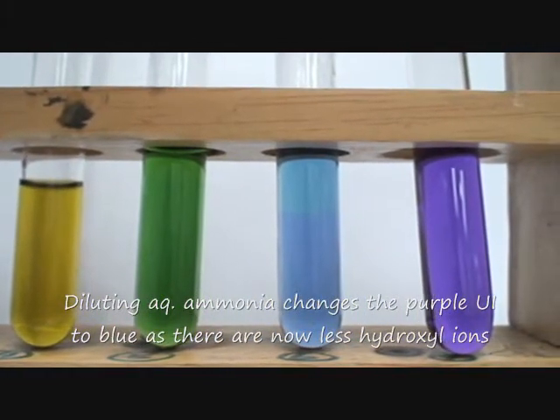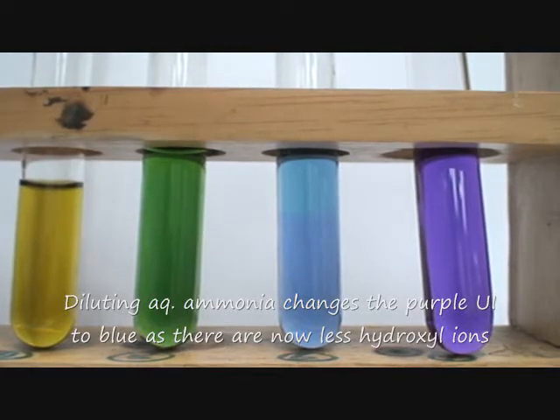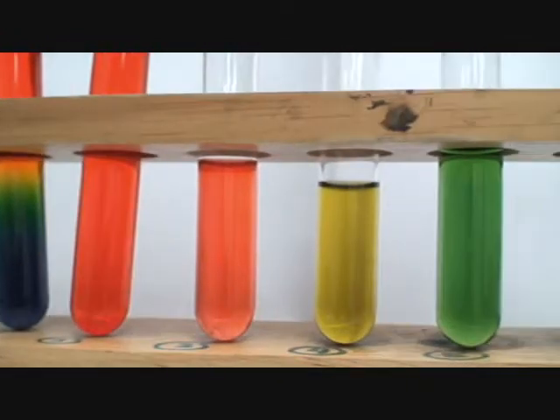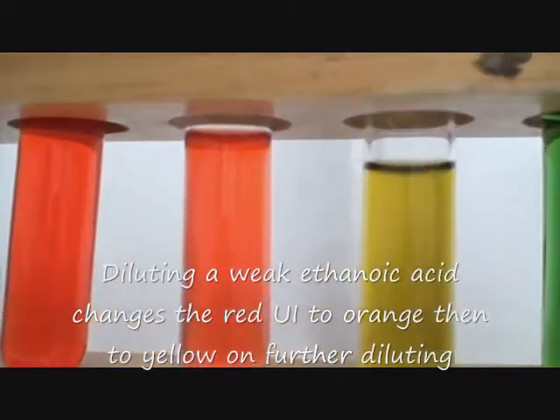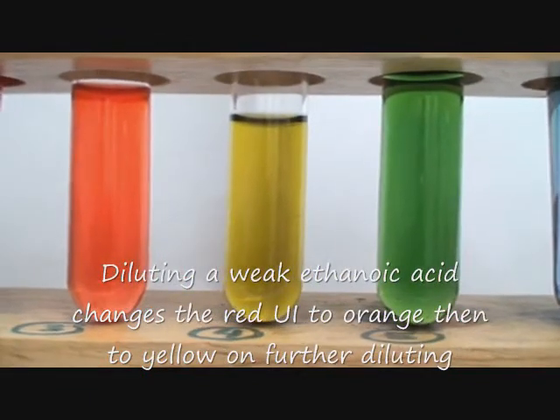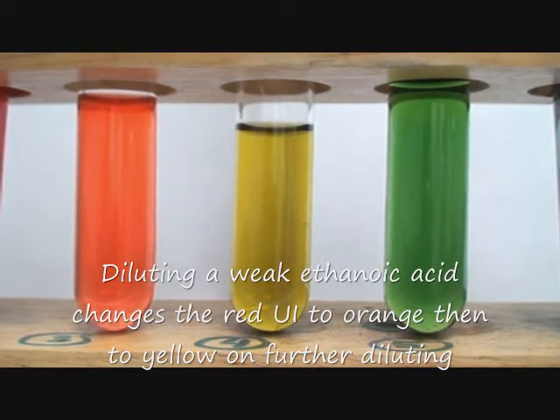It becomes green. So I get purple or violet to blue to green by diluting aqueous ammonia. Then from the other side I take ethanoic acid which is red and keep diluting it until it's orange, and diluting it further it becomes yellow — meaning the hydrogen ions become less and less as you dilute.